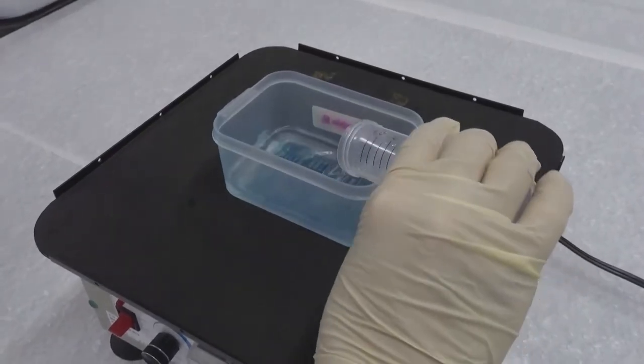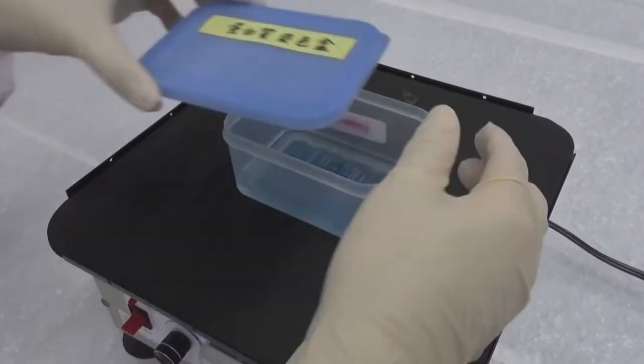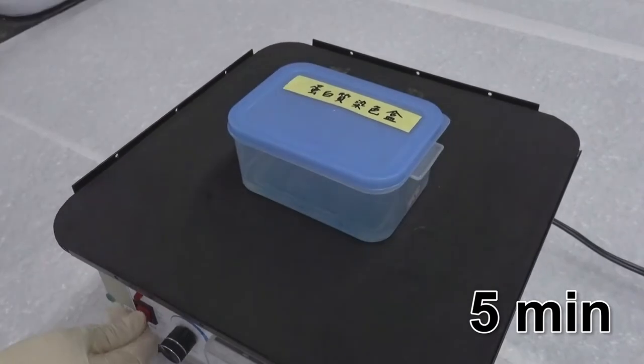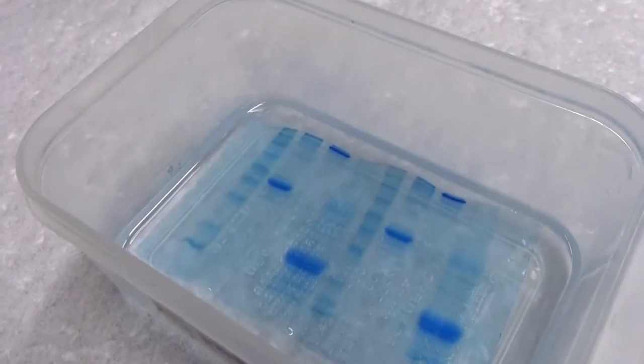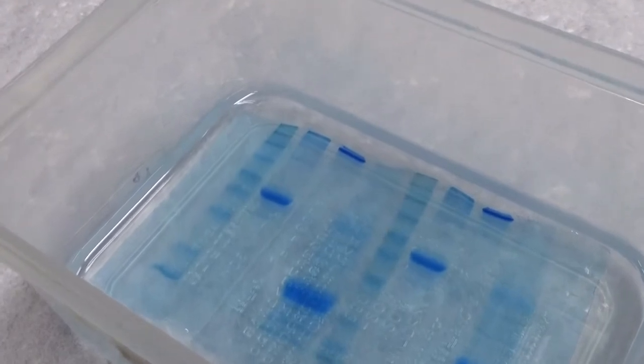Finally, add 25 ml deionized water to wash the gel with shaking for 5 minutes. By now, you can see blue protein bands appear in the gel.